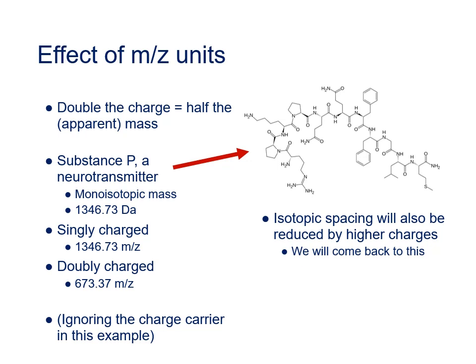Consequently, in mass spec, it's very important to be able to work out what the charge on an ion is, and we'll go on to look at methods for this in the next session.